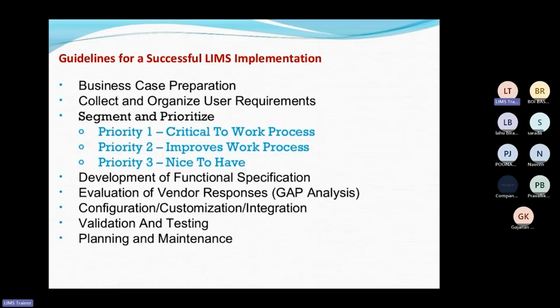Now, implementation is very, very important for the LIMS software. Whenever it comes to implementation, there are requirements and guidelines for achieving a successful implementation of the LIMS software in a laboratory. There is a flow, starting from the software development, which is the IT part.